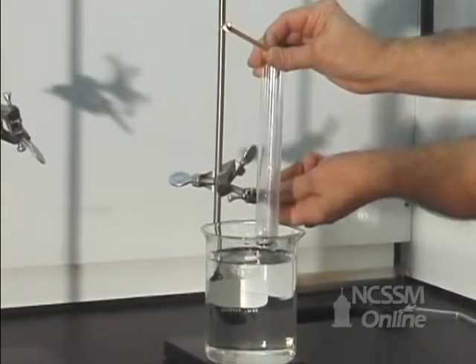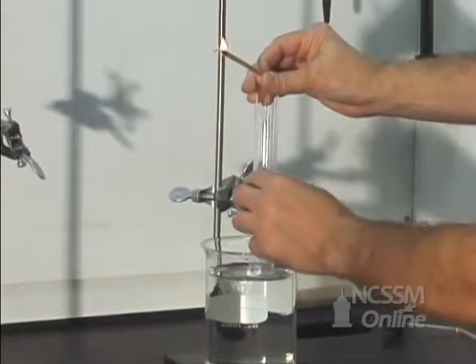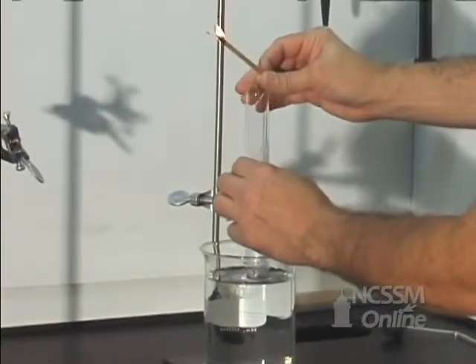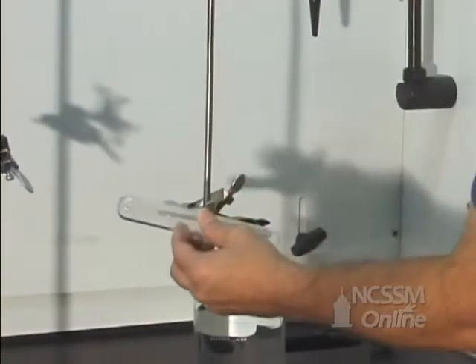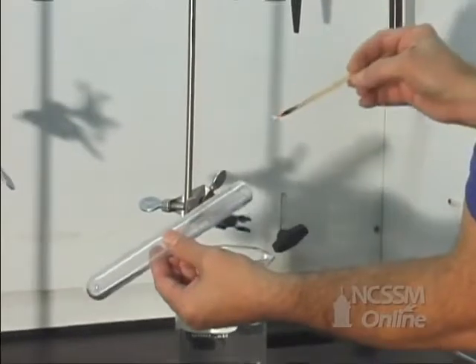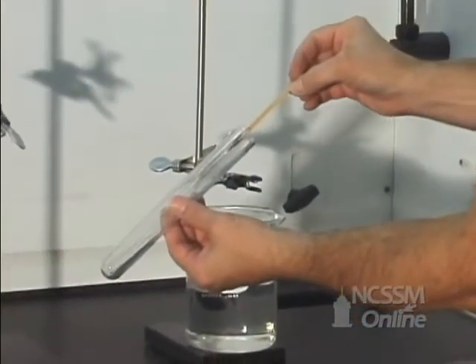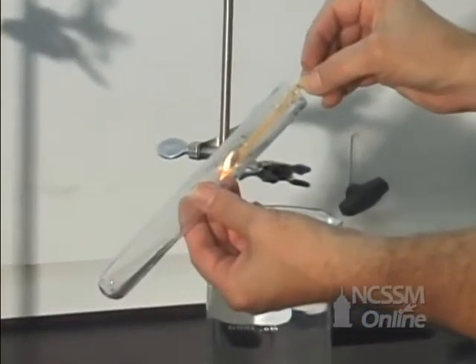We can demonstrate that the gas collected is oxygen by testing the gas with a glowing splint. As a glowing splint is brought into the test tube, the combustion accelerates in the oxygen and the splint reignites.